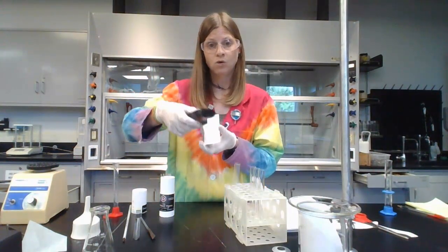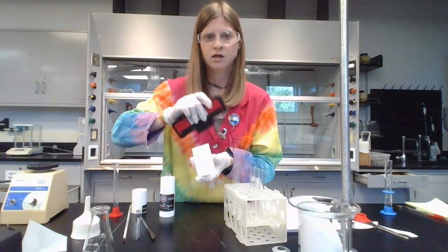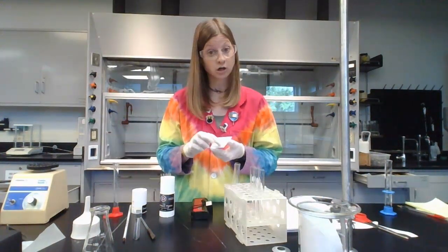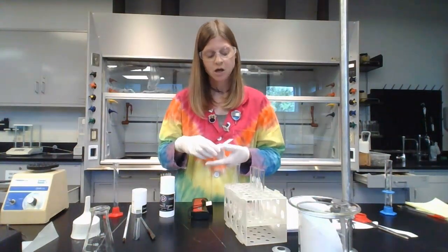So in order to see the spots, you will have to use a UV light where, I don't know if you can really see the green, this white coating turns green when treated with this UV light. Your spots will not be green, they will just be dark. Okay, so that's how you can check how big your spots actually are. Make sure that they're dark enough and big enough to actually let this run.